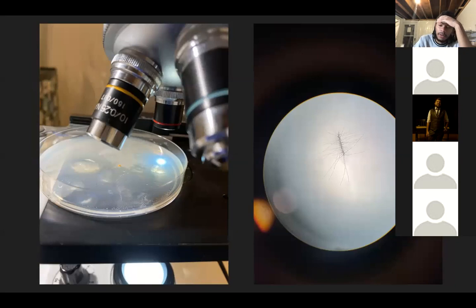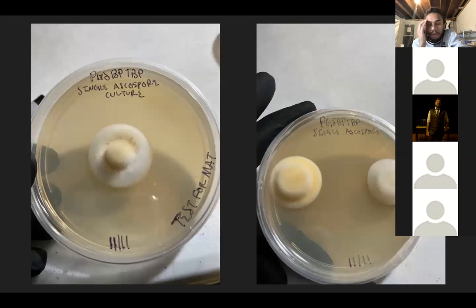And then, underneath the microscope, look until you see your scalpel under the microscope, and then pull the one spore out and put it on a clean petri dish. If you're lucky, you'll get one spore, hopefully.